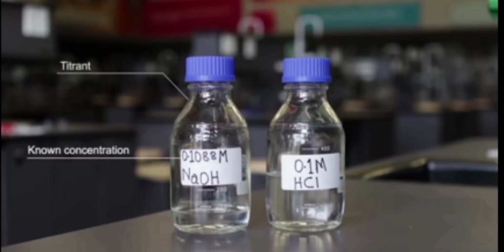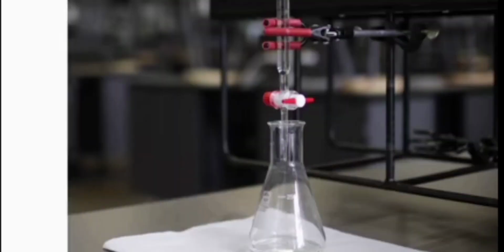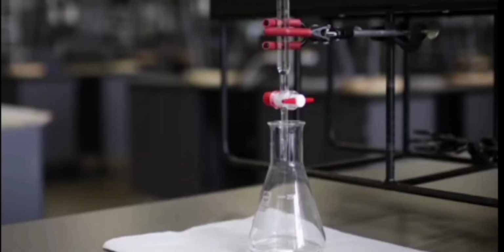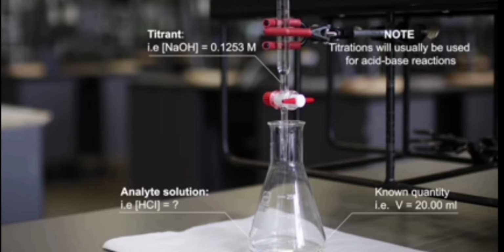What is a titration? A titration is a technique where a solution of known concentration is used to determine the unknown concentration of a solution. Usually, the solution of known concentration, or titrant, is added from a burette to a known quantity of the analyte, the unknown solution, until the reaction is complete, which is indicated by the endpoint.